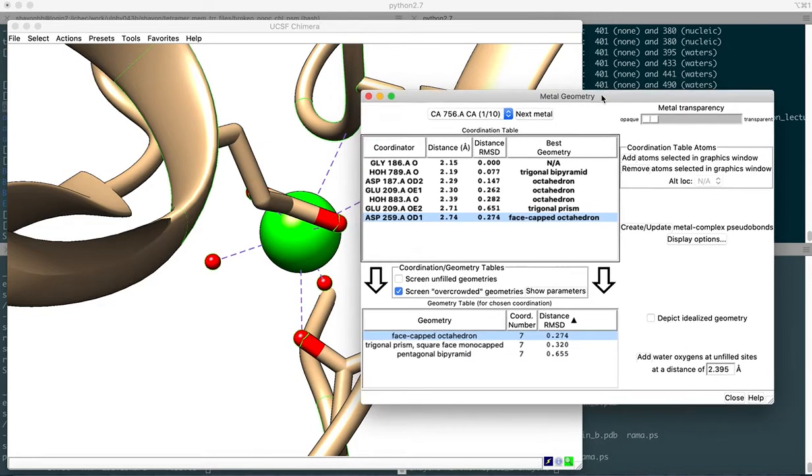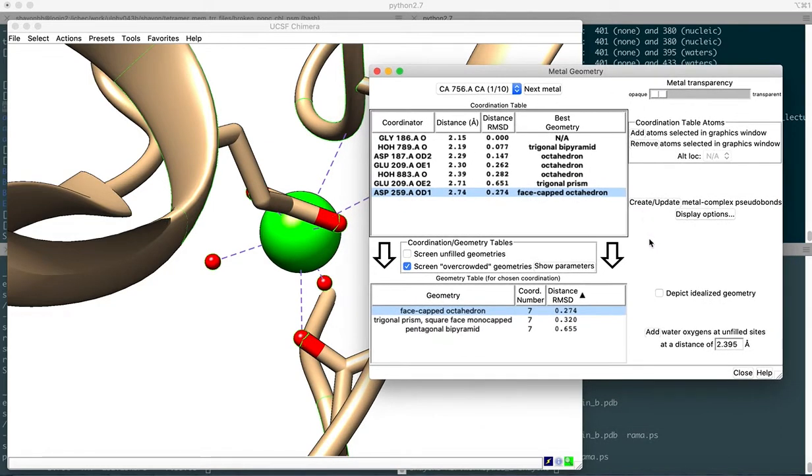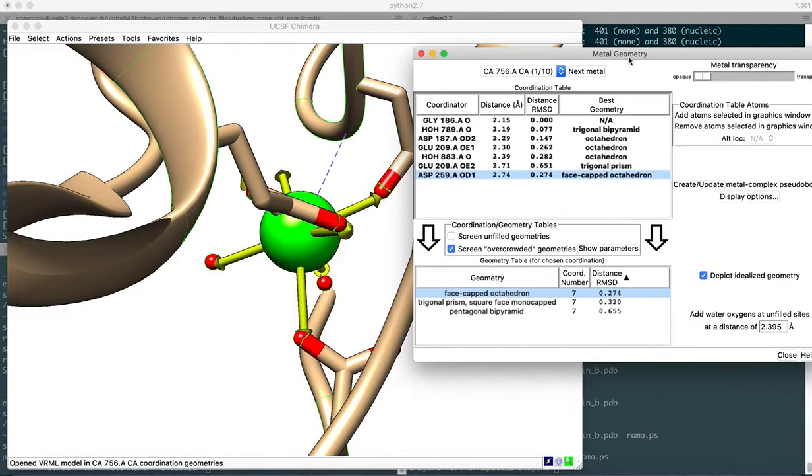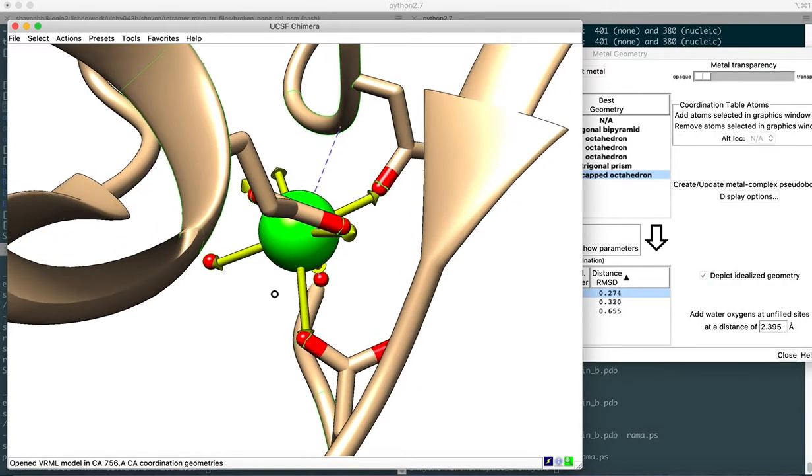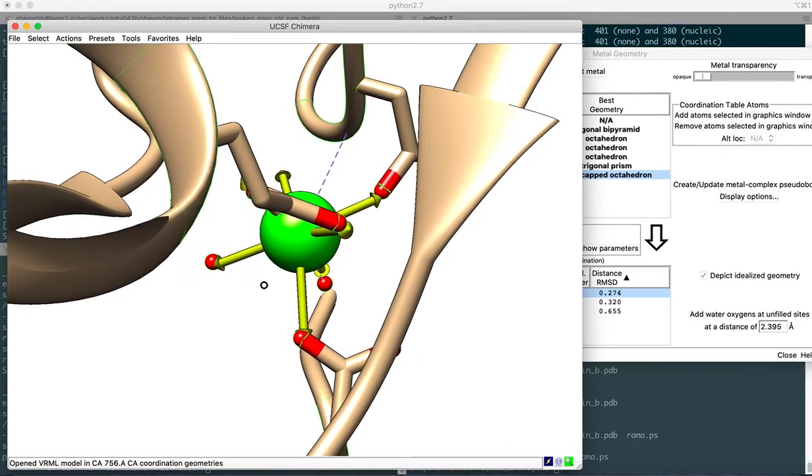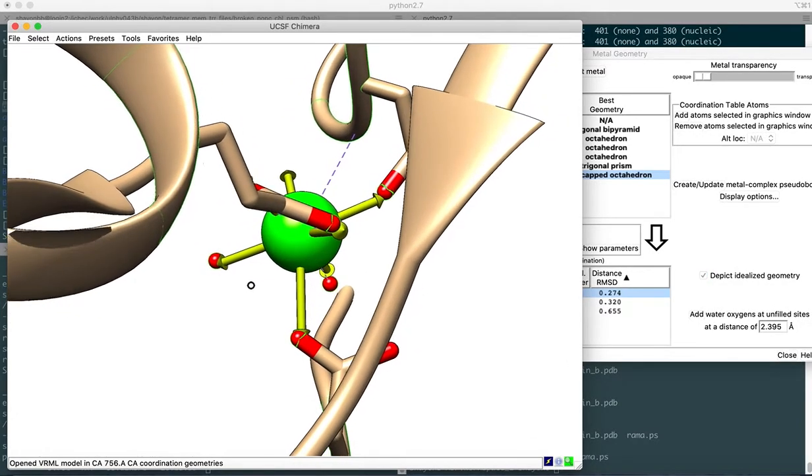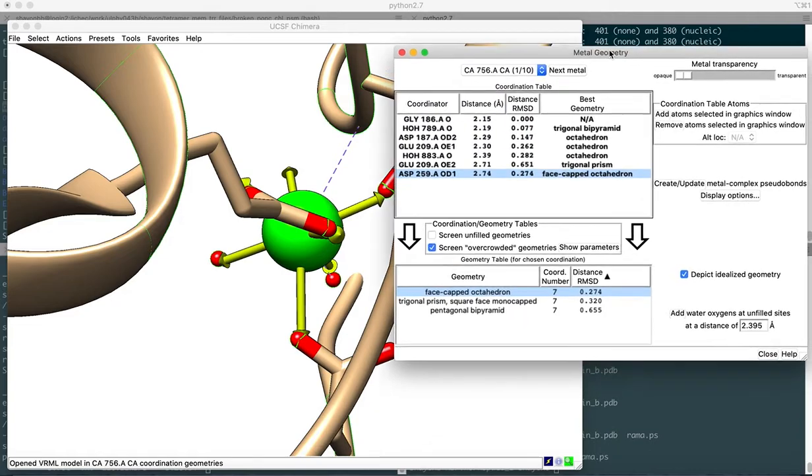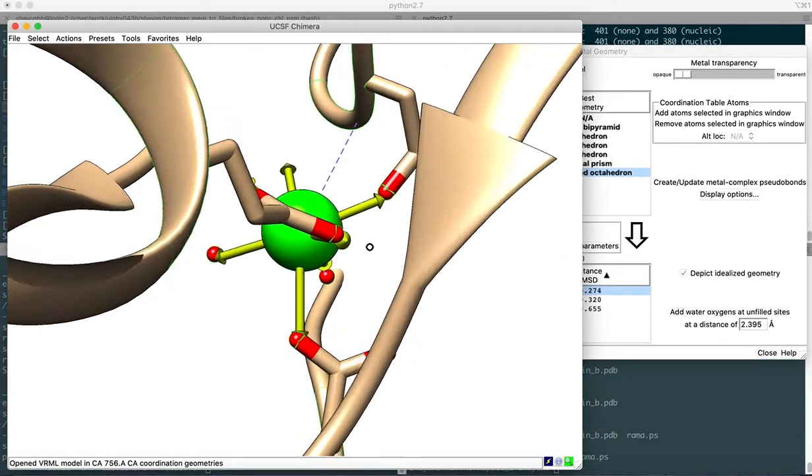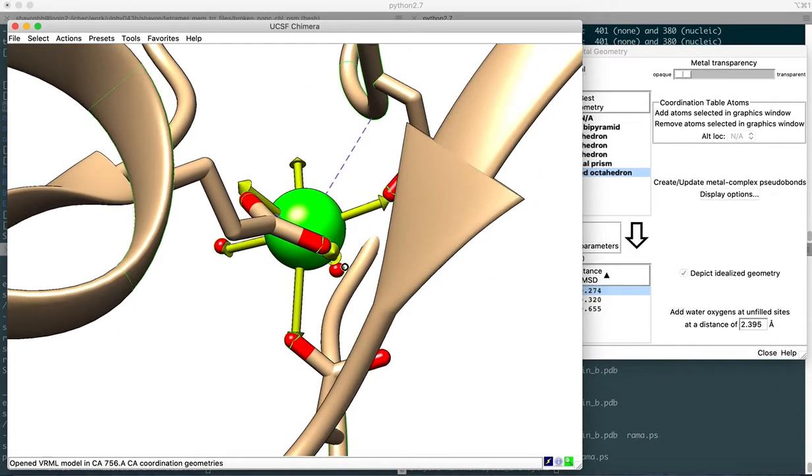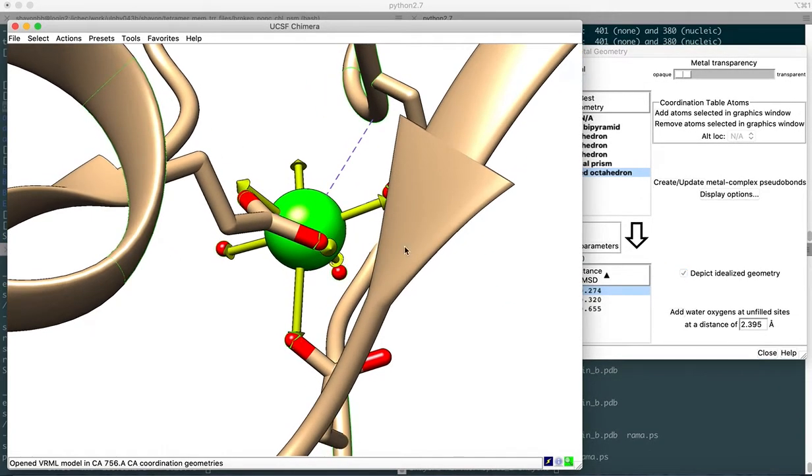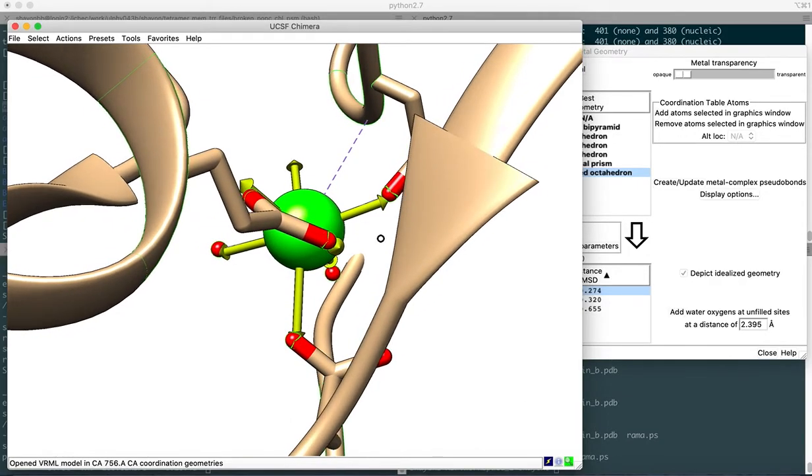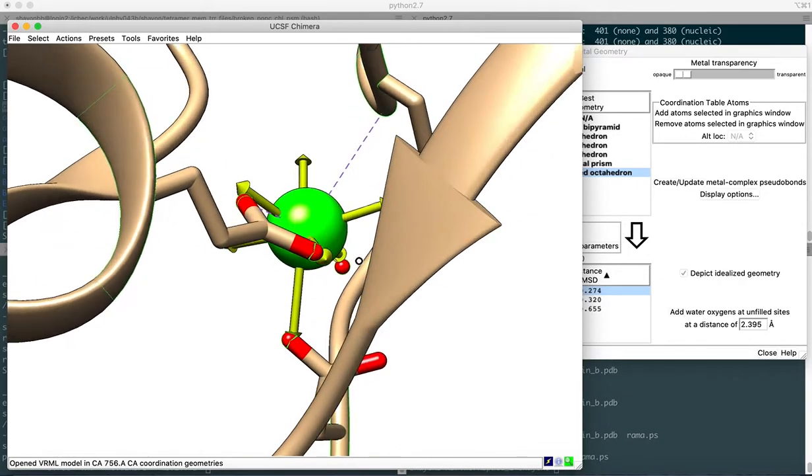In order to depict the ideal geometry, you go ahead and check this option. Once we check this option, you'll find that the idealized geometry, the geometry that was supposed to be found with regards to that particular position of the calcium ion in this pocket, and with the vicinity of the surrounding residues including water molecules, will be depicted. You can easily assess the deviation that might have occurred due to the crystallization method.